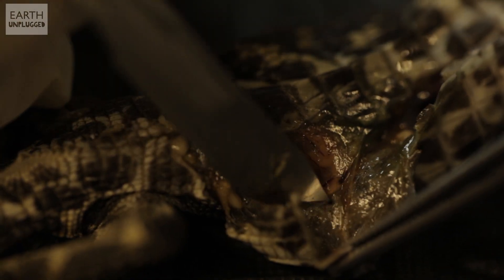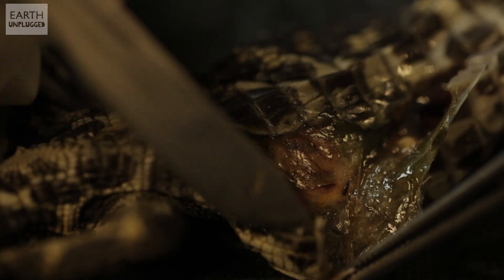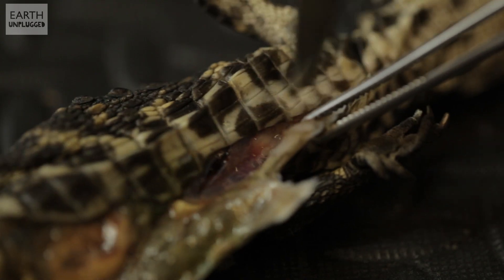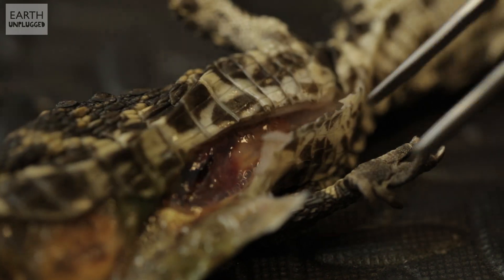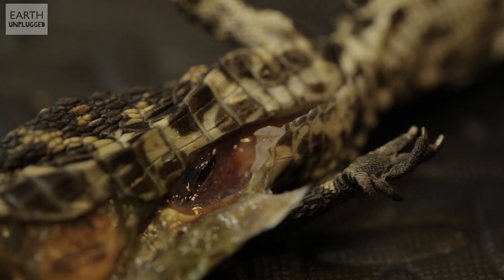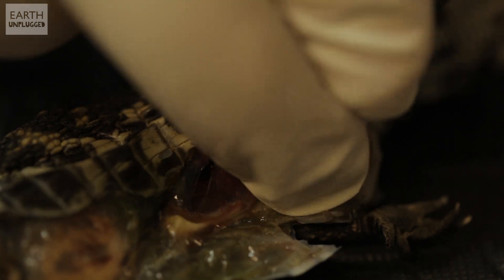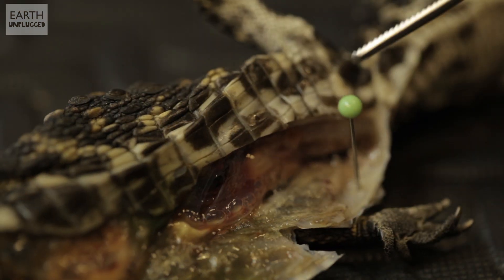So the skin, even though it's such a tiny hatchling, the skin's still very, very thick. What we found in our monitor lizard decomposition was that reptile skin has something called beta-keratin in, which really struggles to decompose. And there are reports of crocodile skin lasting for years in the wild on rotting carcasses.